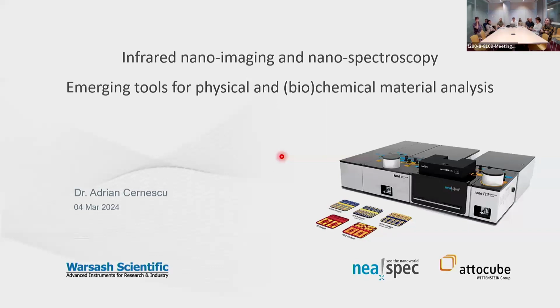As Anders introduced, I'm going to speak about infrared nanoimaging and nanospectroscopy. I'm going to make a very brief introduction to the technology, to explain how we can overcome the diffraction limit of light to be able to measure the optical properties of materials with nanoscale resolution.